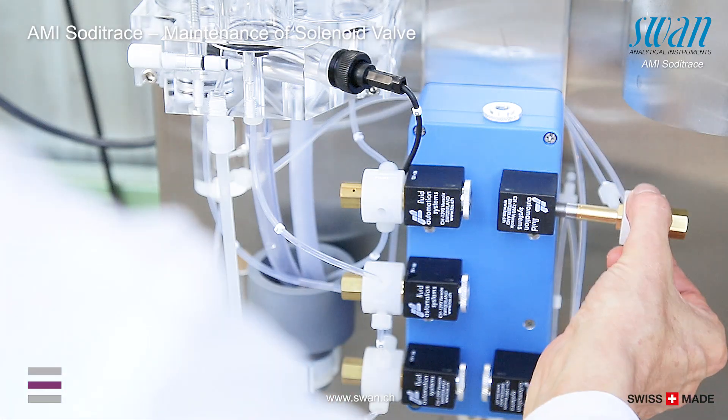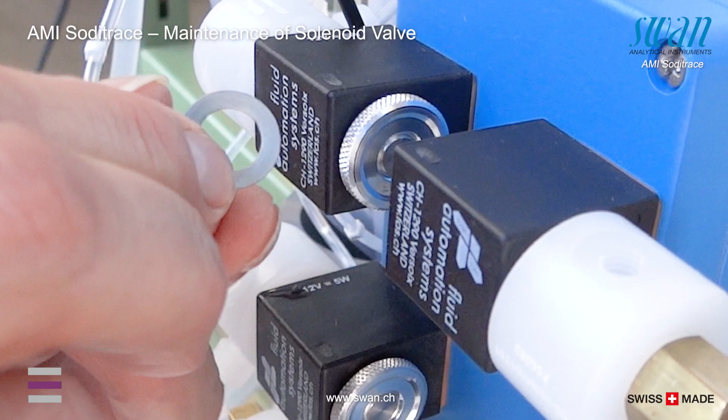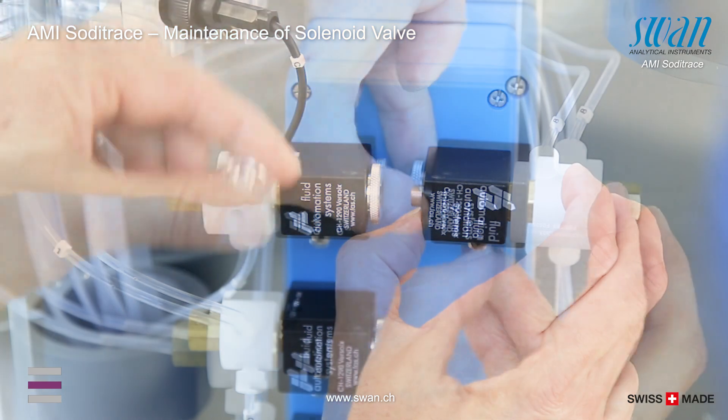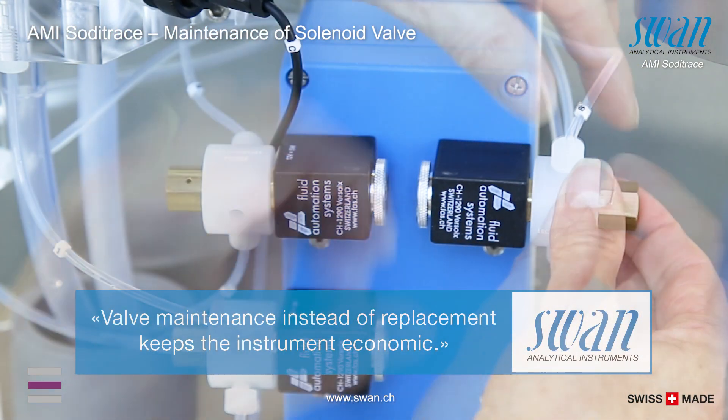Mount the valve assembly by pushing it into the coil body. Connect all tubes. Only then screw on the knurled nut finger tightly.